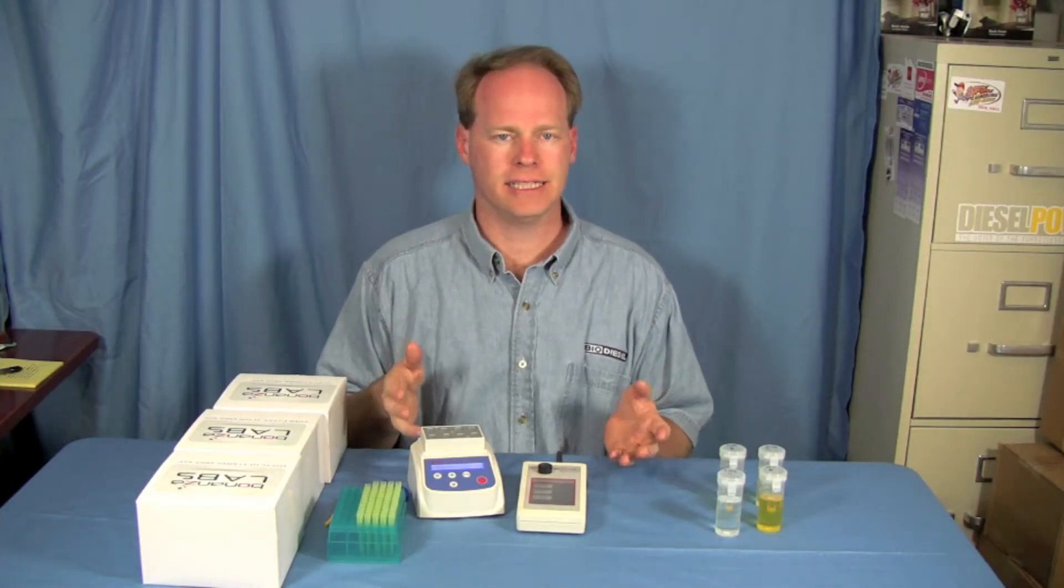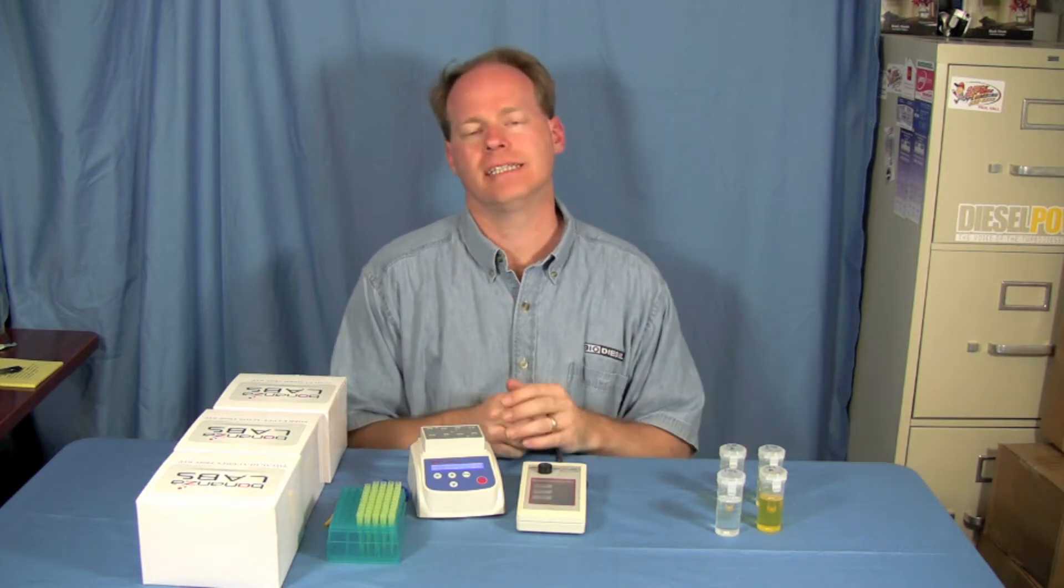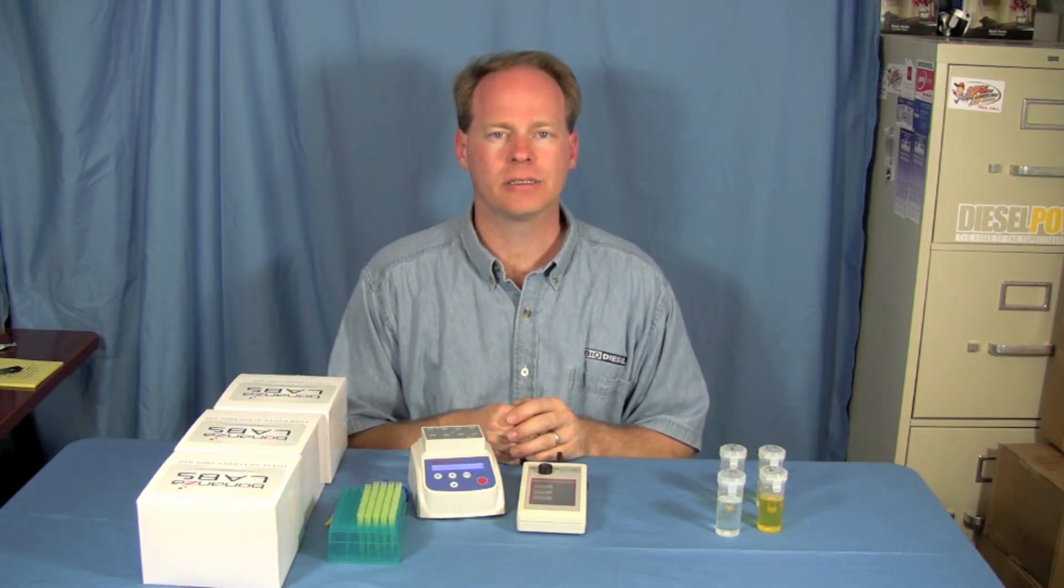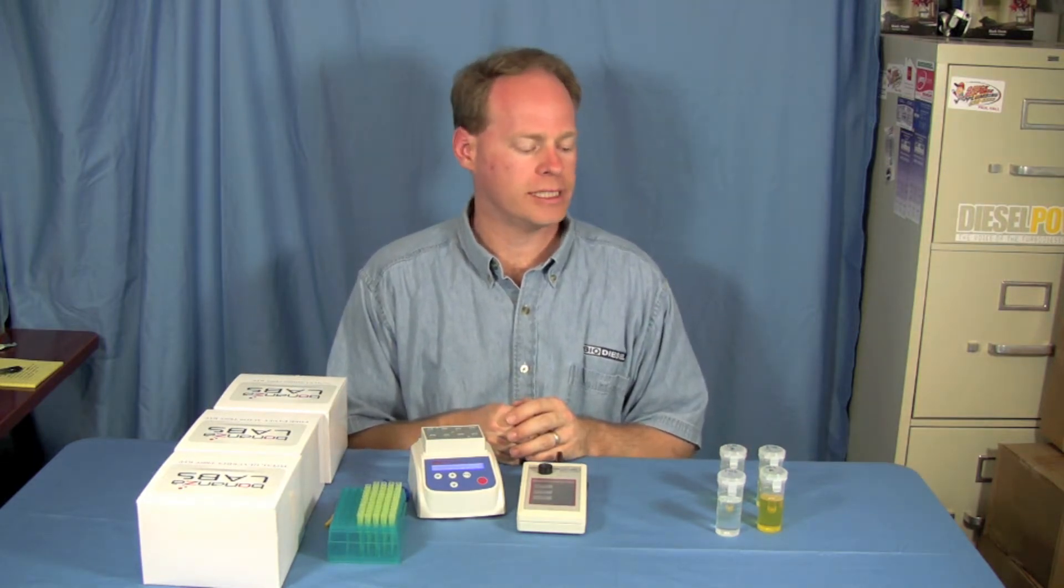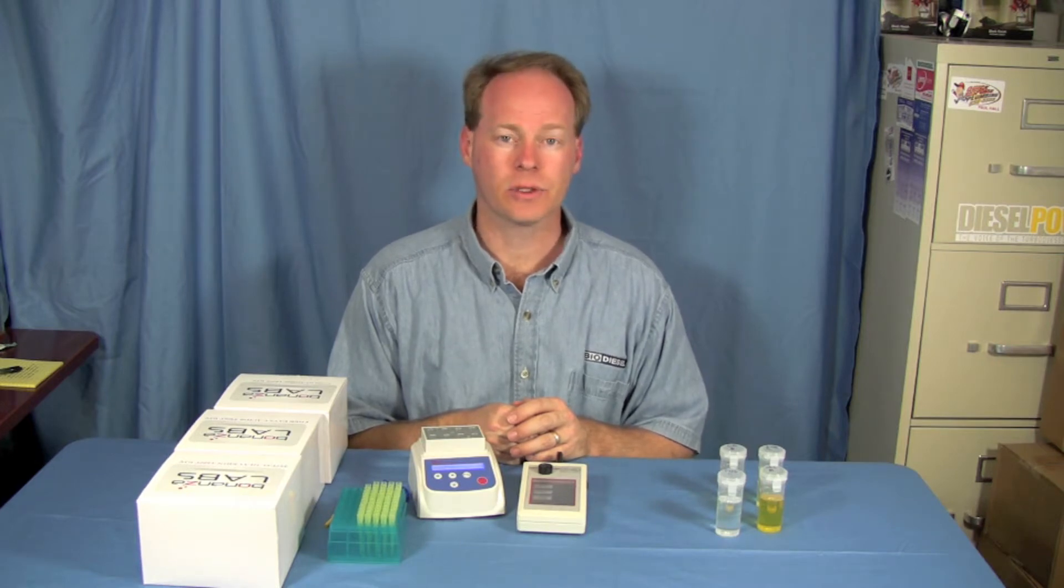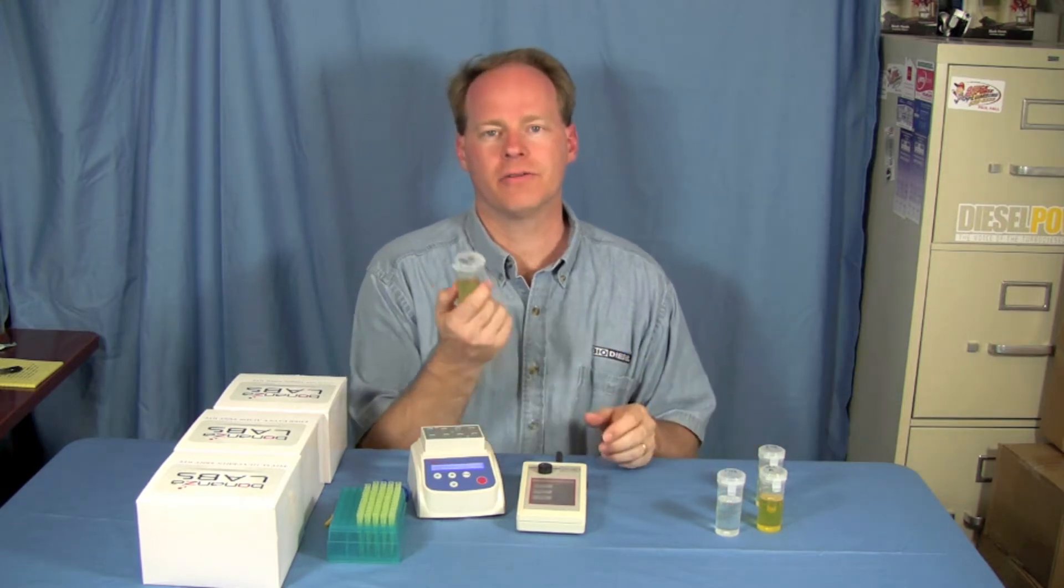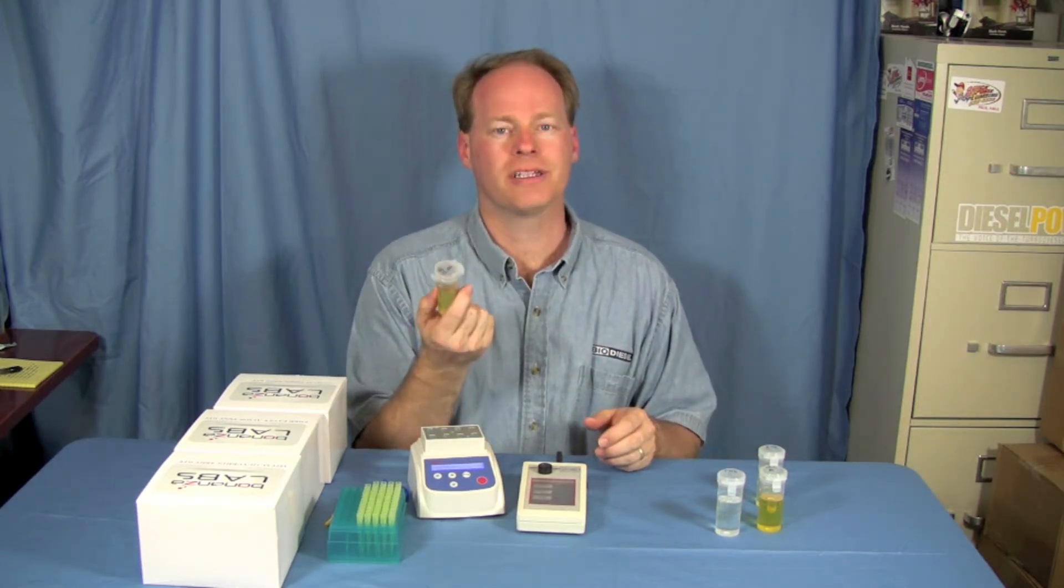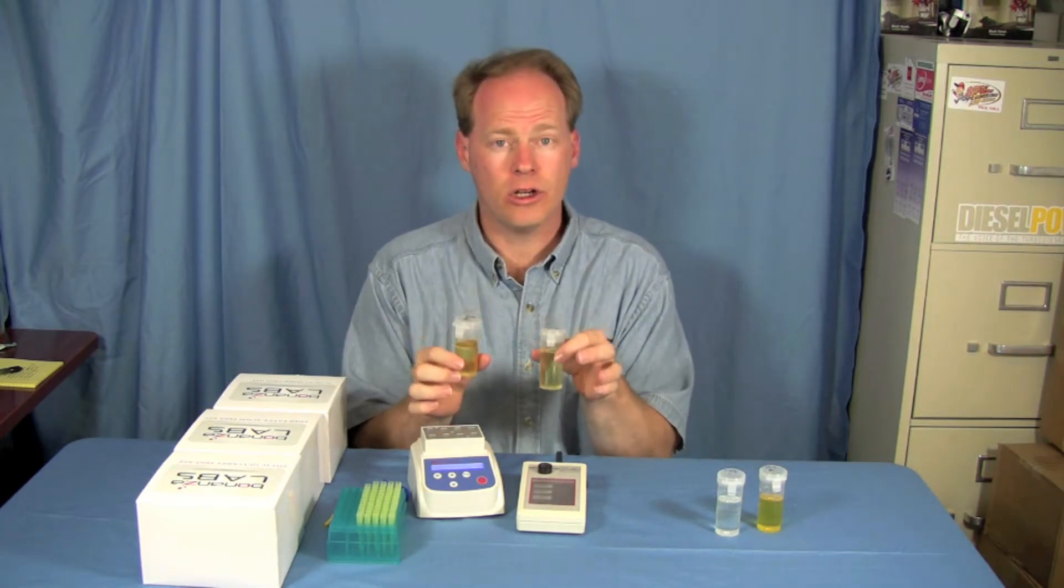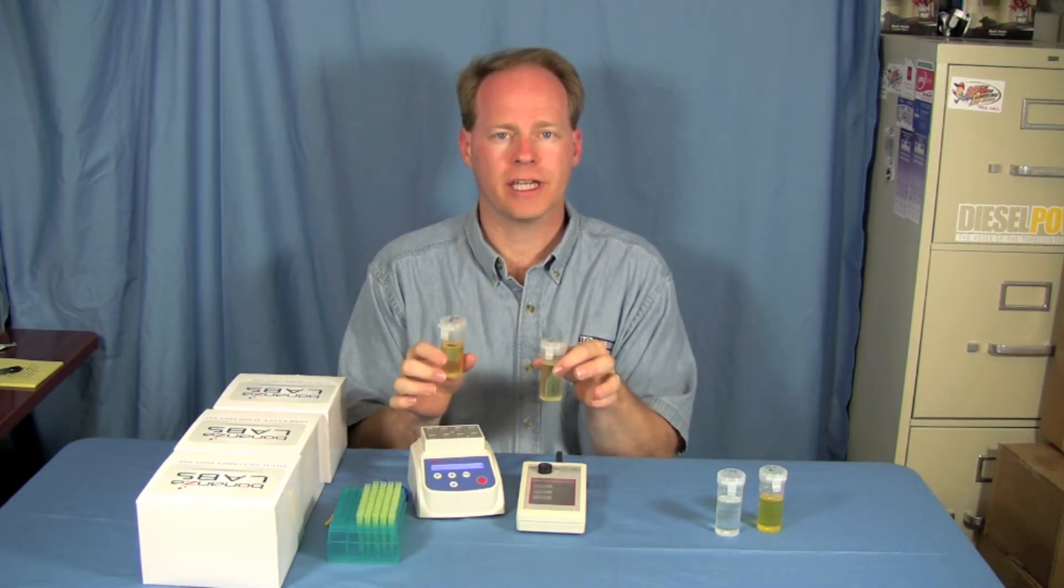The mini scan allows us to test oils and biodiesel to see if we meet certain specifications. For testing biodiesel we can test for total glycerin to see if we're close to the ASTM standard. It's really cool because you don't have to send fuel off to a lab anymore. You can test it in-house and know that you're within specification.